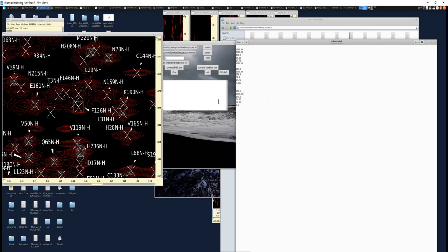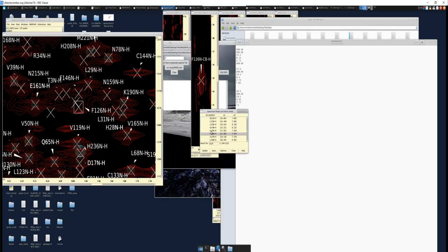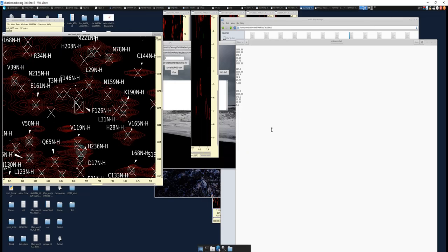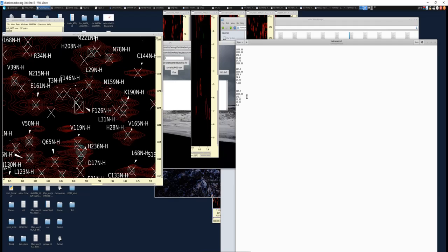So let me bring up the strip plot. Let me go back down just to show you how this can work just as well, even if the structure is not solved. Sorry, phenylalanine. So 117.5, and then the HNCO, or the carbonyl value, I should say, 177.9.